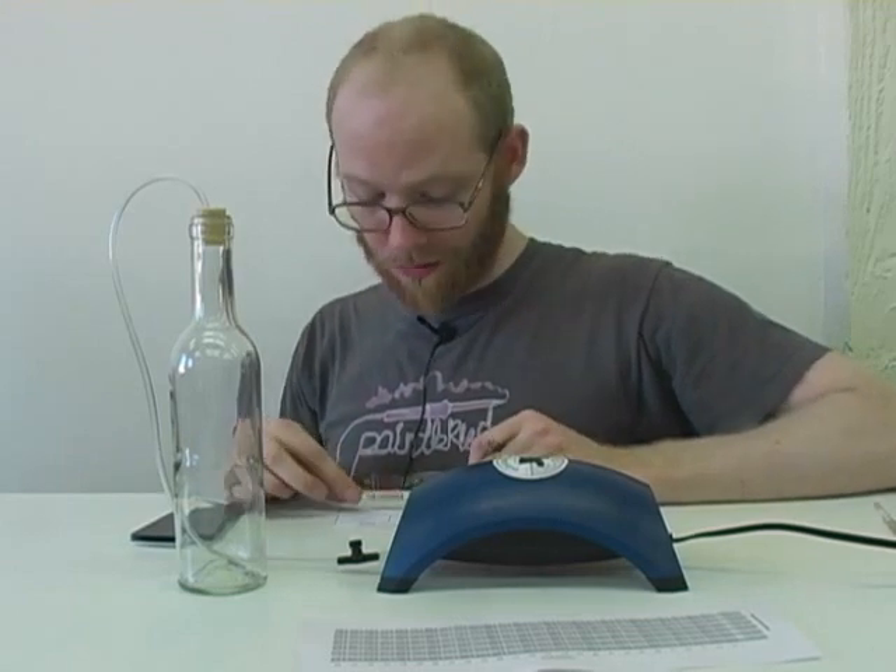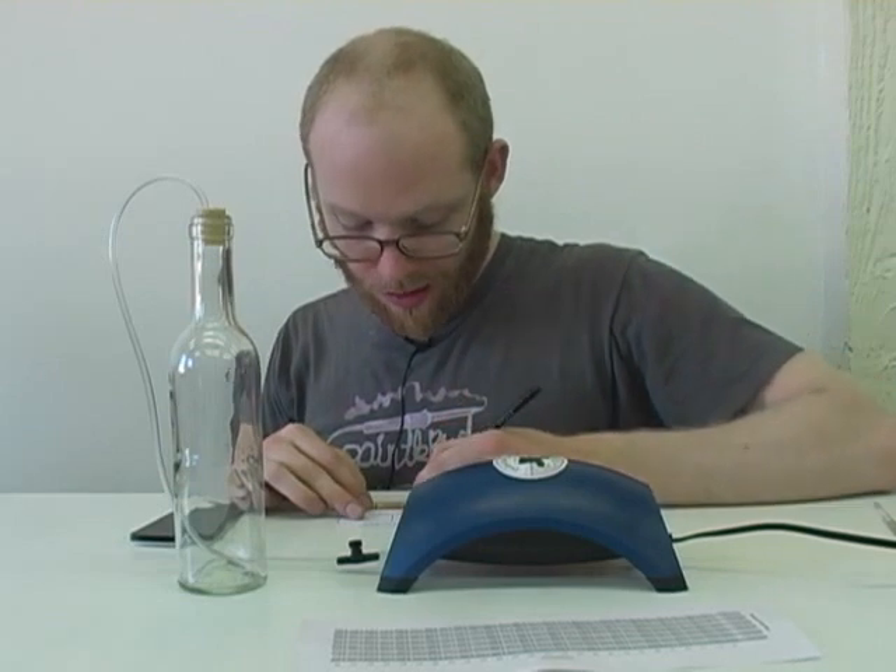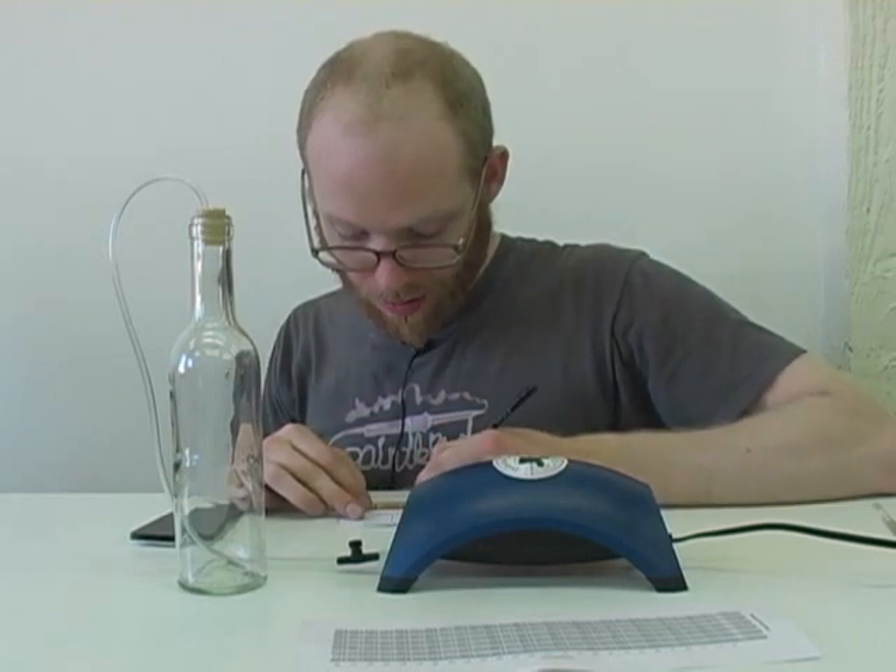I'm then going to take a photo of the test card — the final photo — and then I'll email it to myself as an extra record of the timestamps that I used.